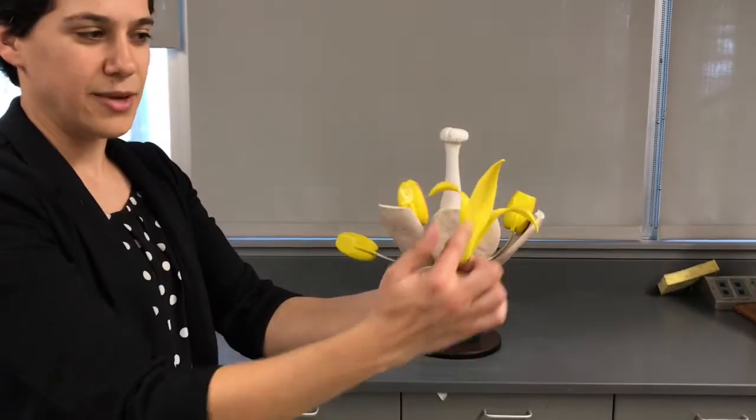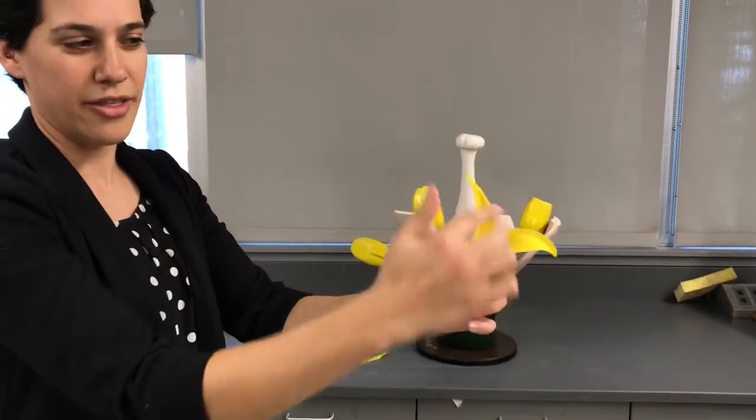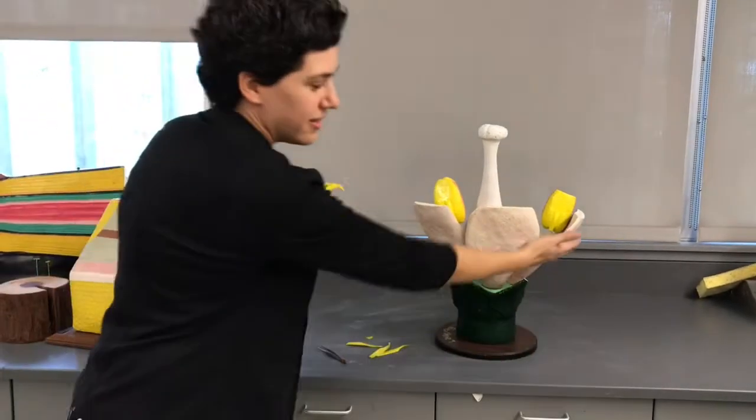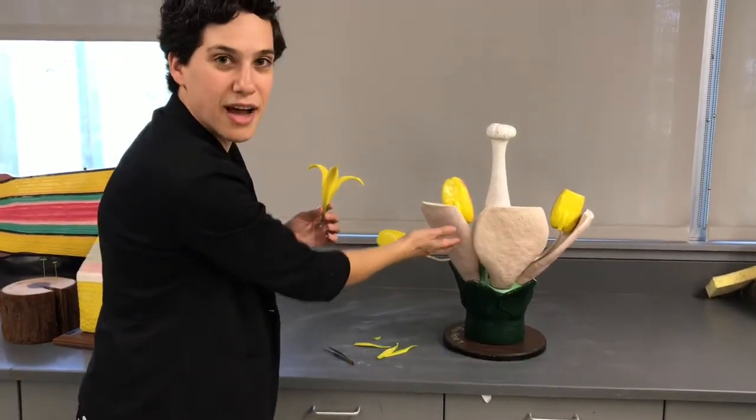The next thing that you would see, the next layer, are the petals, which are here on the lily, and these are where the petals would be on this flower.